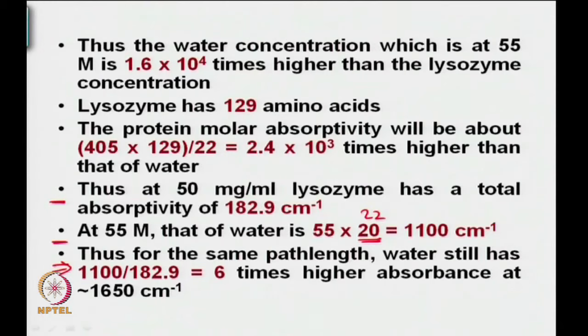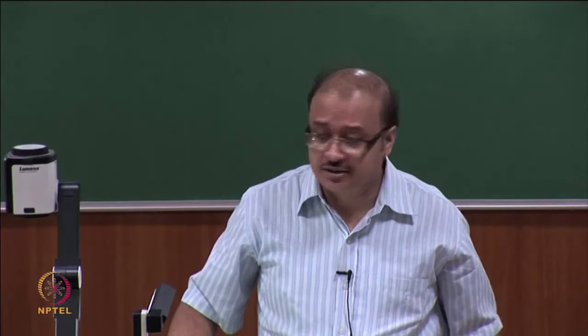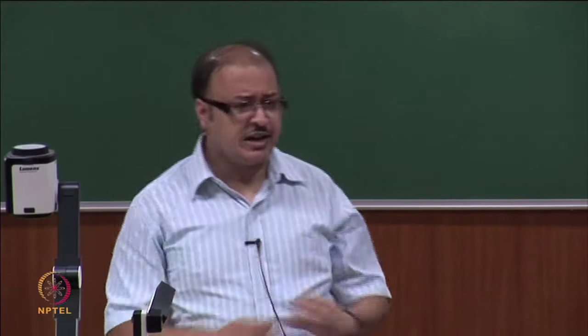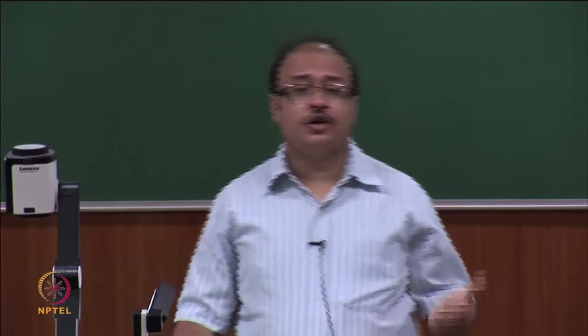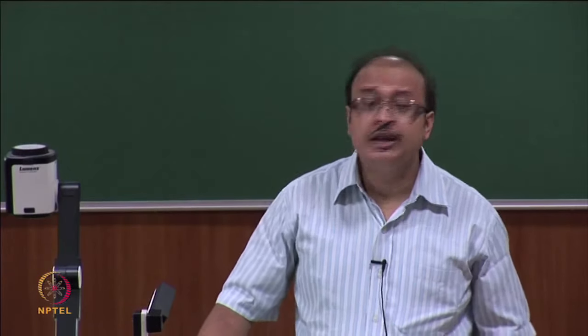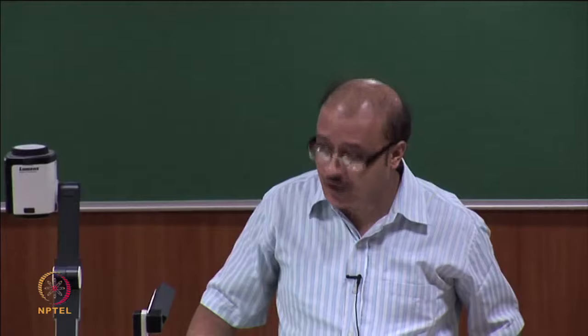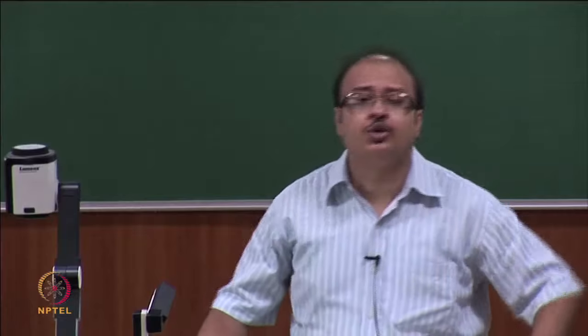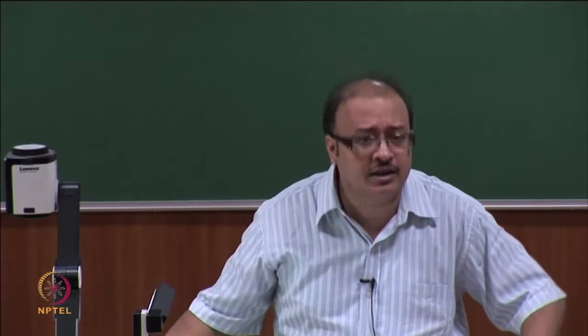Okay. So, what we will do is, as you can understand, we will stop here in this class, but what you can take home from here is that just taking an IR spectrum is not so easy. There are some things you have to keep in mind. First of all, you have to make sure whether you are going to take the protein in water or D2O. Sometimes people say that if you exchange with D2O, the protein conformation can change or some other effects can happen.